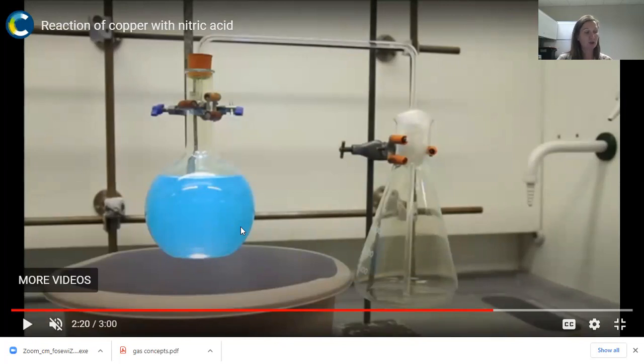That's that copper 2 nitrate. That's what you're seeing now, the copper 2 nitrate. And it's aqueous because it is dissolved, or soluble, in the water that it's in.